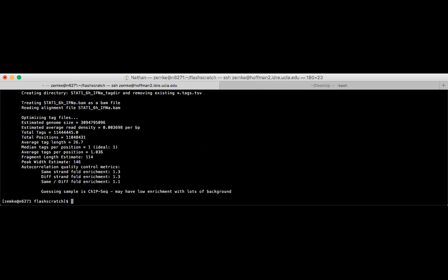All right, so I've created the tag directories. Now I think we already loaded Homer, so we can run getDifferentialPeaks, which is pretty quick, I believe. Okay, getDifferentialPeaks, STAT1 30-minute, -a peaks.